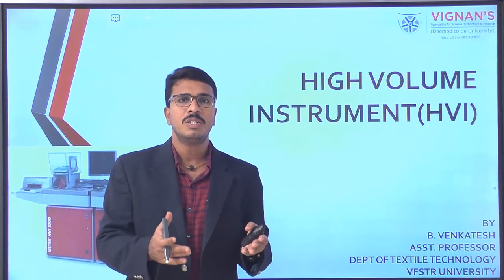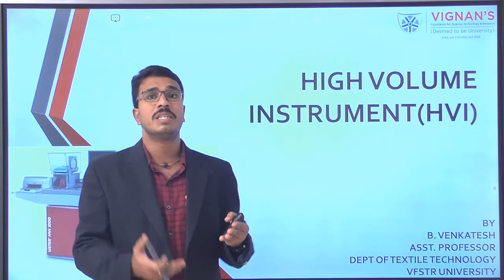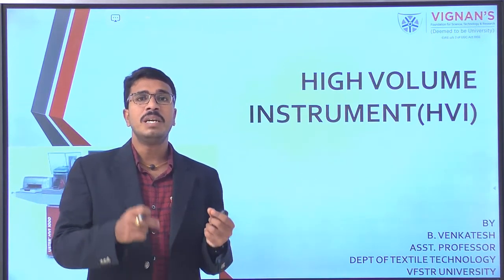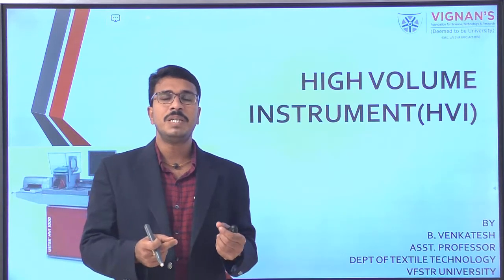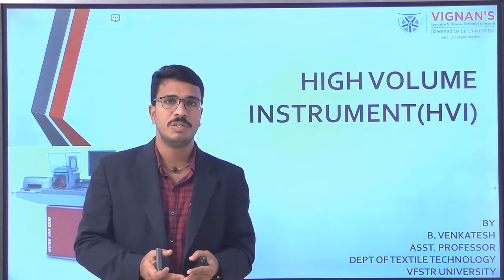Apart from that, we are going to discuss the high volume instrument and the advanced fiber information system. These are the two latest developments in testing of fibers, especially for its various dimensions.